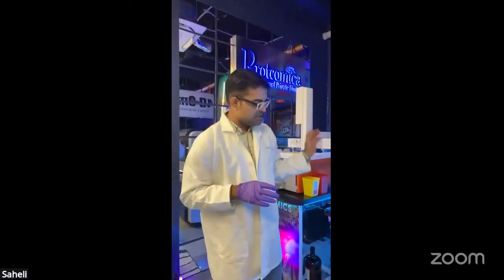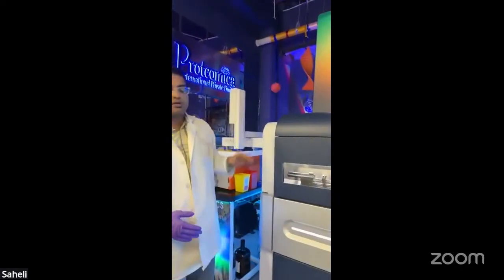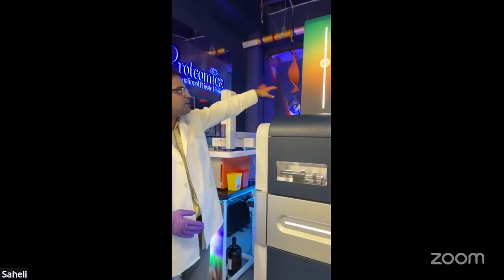So what happens? You have to think like a ship. There is a ship which is sailing. The ship which has longer sails can capture more air and it can move faster. Similarly here, the bigger ions will move faster, and the smaller ions will be left behind. You will have a drag force also. At a certain point of time, it falls down and then it goes to the timsTOF Pro TOF detector.